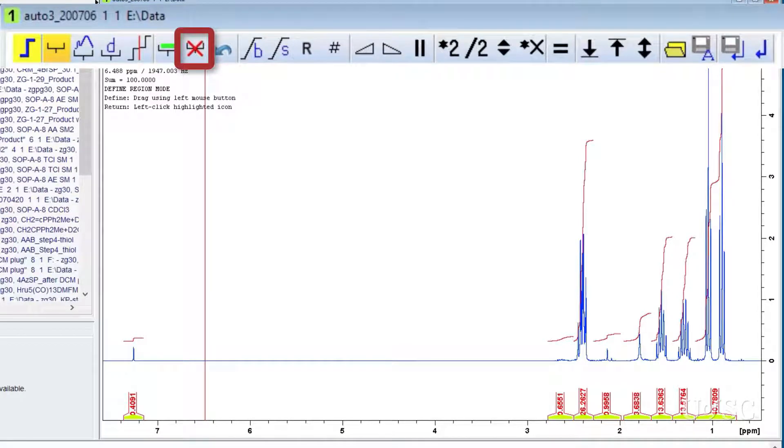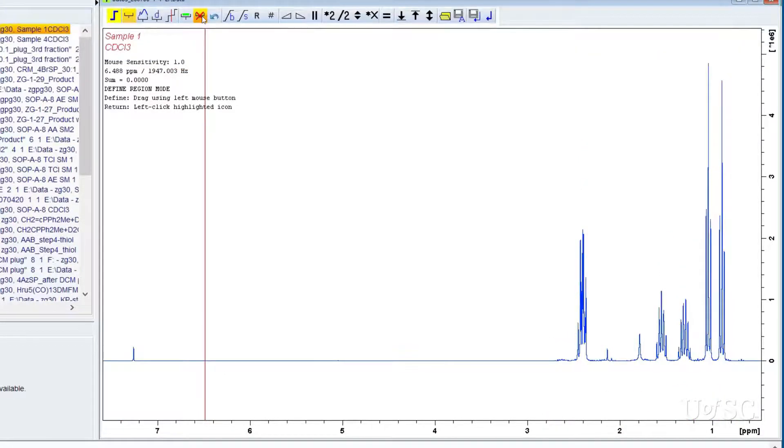The icon with a bracket and red X will delete the selected integrals. You should be left with a non-integrated spectrum.